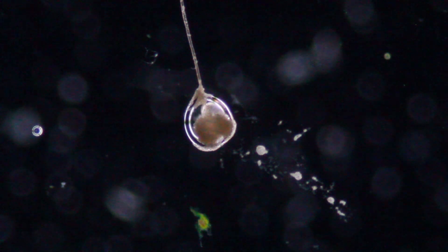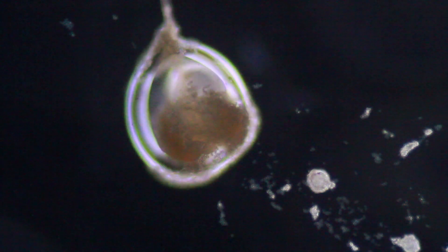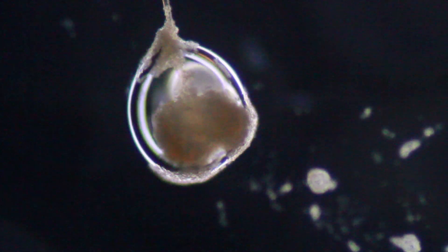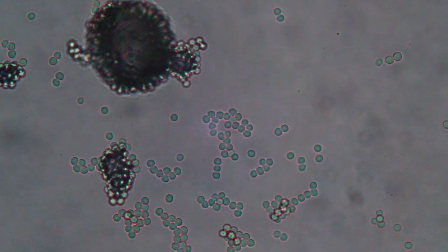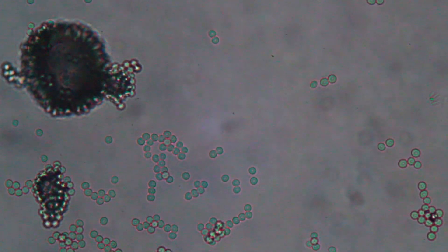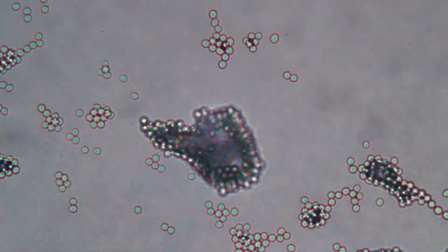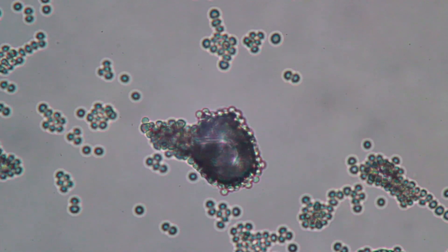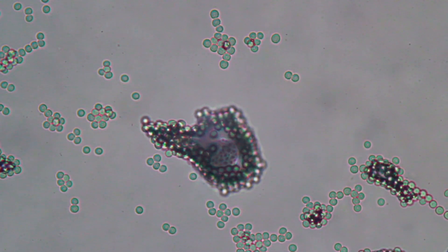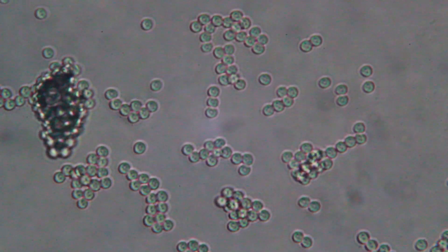When enlarged a little bit more, I saw much better that it's actually also surrounded by an air bubble. Evidently, the water was not quite able to reach the spores — the spores are hydrophobic and do not like to be in contact with water. At a different place, now in brightfield, I finally got a very good picture of the spores. These are the round circles that you see — thousands of them — some single and individual, some sticking together. These are the reproductive spores of the fungus.